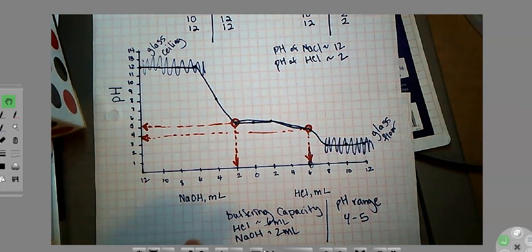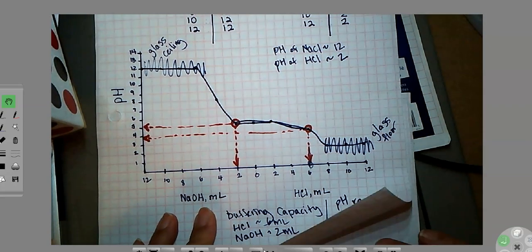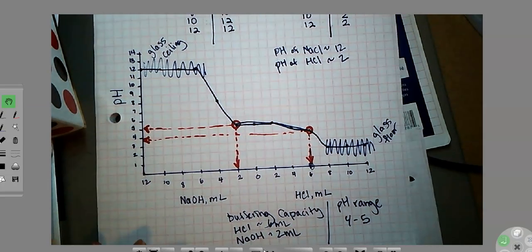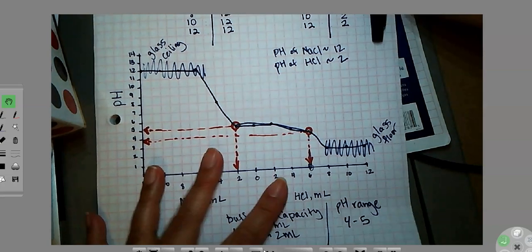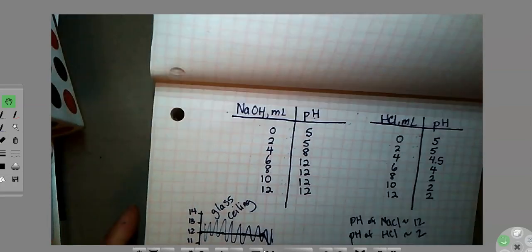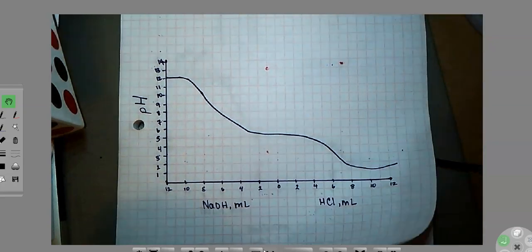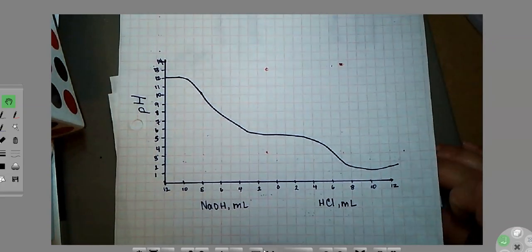Okay, now the next one, I want you to look at this and analyze it, and then we'll do it together. After I show you this next graph, I want you to freeze your screen, and, sorry, let's do this so you can't see the back part here.